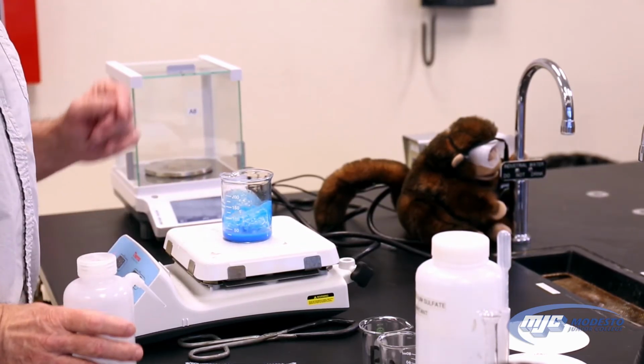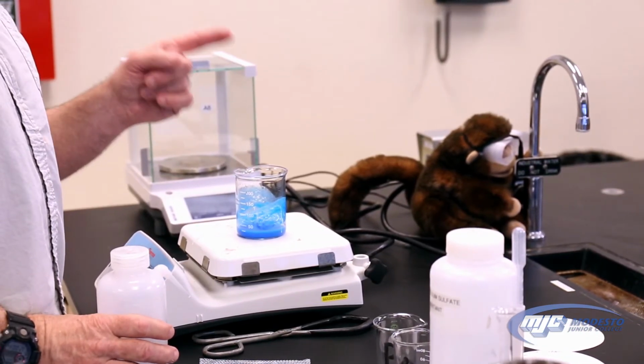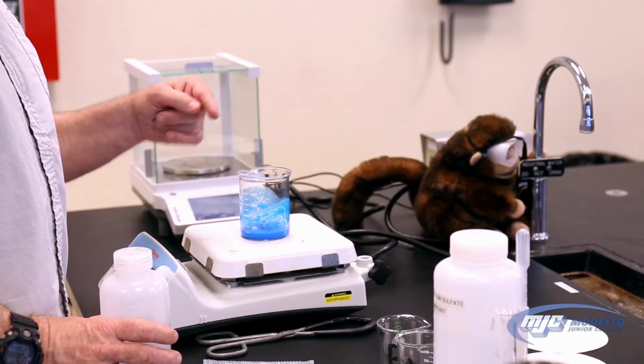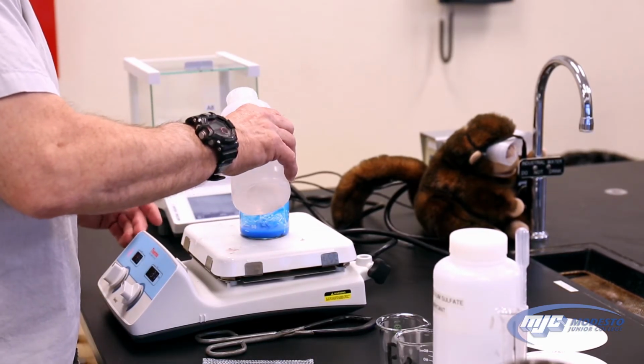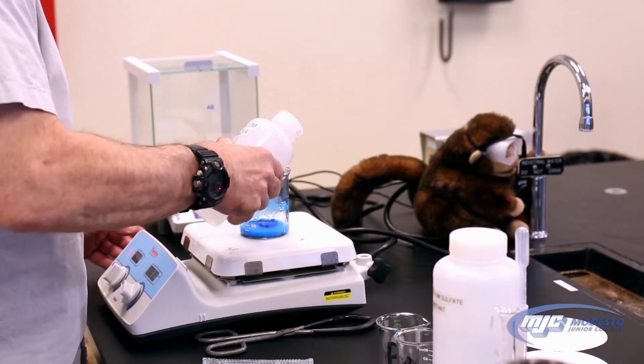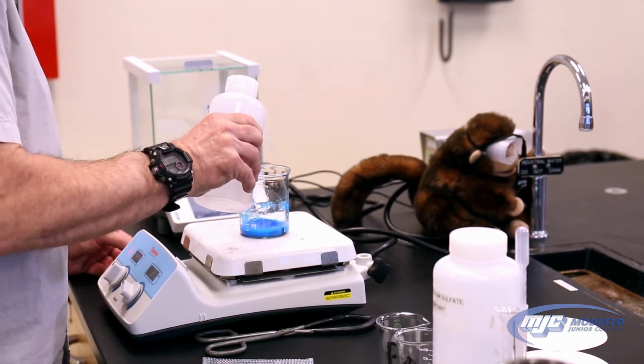So we'll know, guys, when this reaction is finished, because remember, copper 2 oxide is this brown color. So all that blue will be gone, and it'll all be this dark brown color. So the stuff on the sides, I want to wash down, make sure I get it all in the solution there.